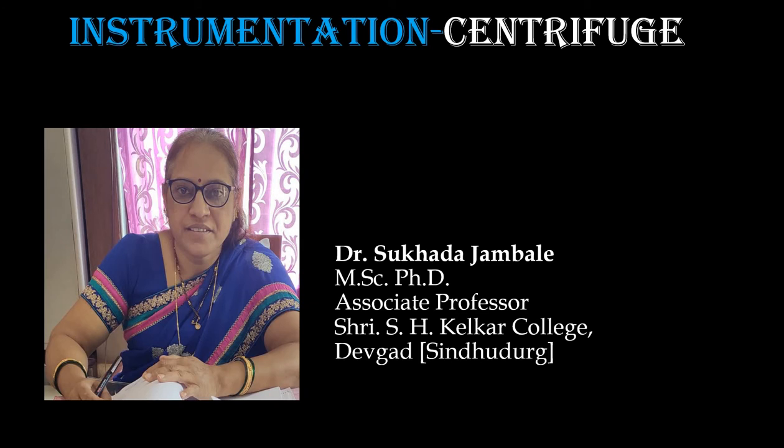This is our lecture series on instrumentation and today's instrument is centrifuge. We'll consider the same in today's lecture with respect to three points. One, introduction; second, principle; and third, the application.